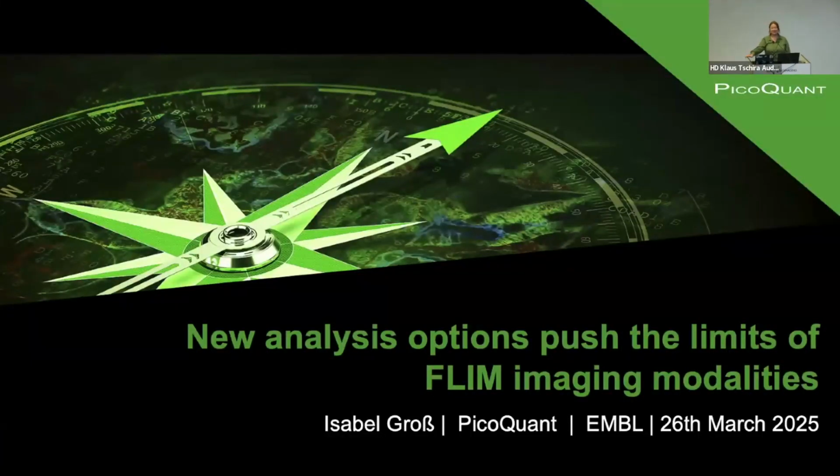I'm an application specialist for microscopy at PicoQuant, and today I'm going to introduce new analysis options to push the limits of FLIM imaging modalities and the software tools that we can provide to go for that.